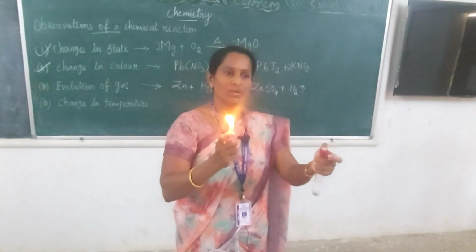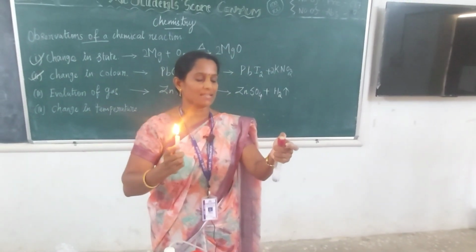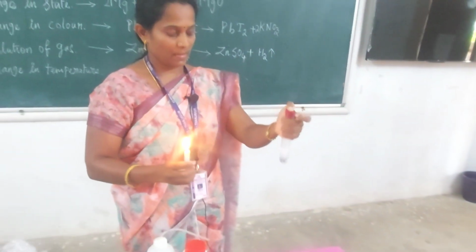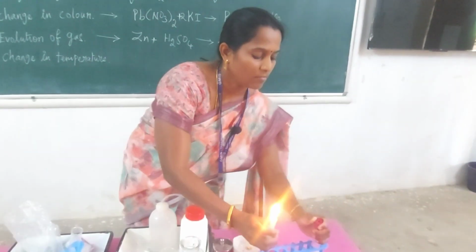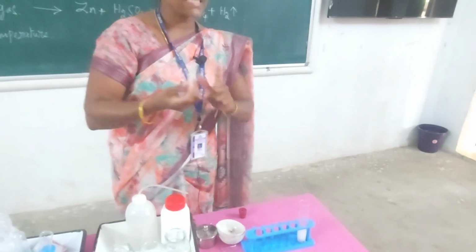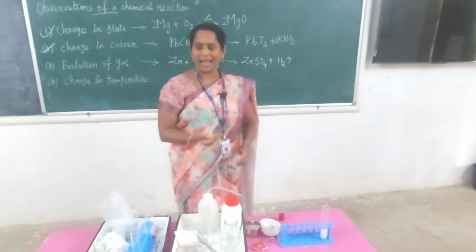That pop sound indicates the hydrogen gas. Other gases will not produce the pop sound. See, this is the pop sound. The sound indicates the gas is hydrogen.